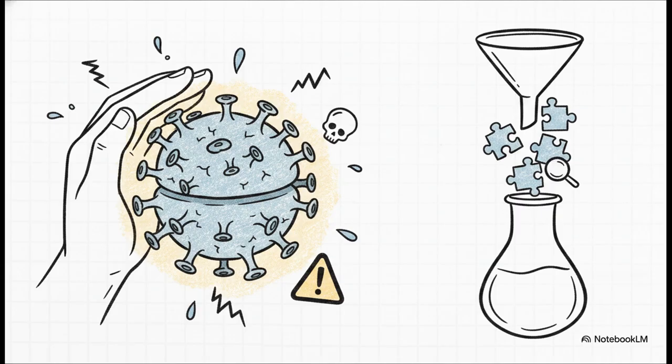However, this envelope makes them incredibly fragile. They are highly sensitive to physical and chemical stress. Because of this added complexity, maintaining really intense control over your input plasmids and raw materials is completely vital to ensure the virus is assembled correctly lot after lot.